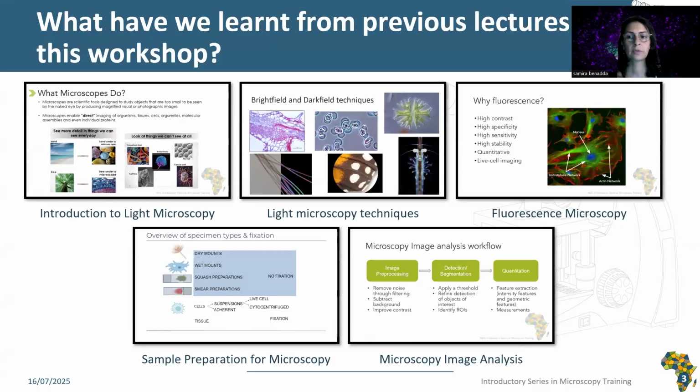In the introductory level curriculum of ABIC, the previous lectures covered topics such as introduction to light microscopy techniques, fluorescence microscopy, sample preparation for microscopy, and microscopy image analysis.